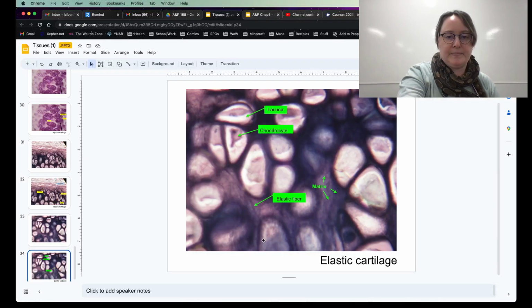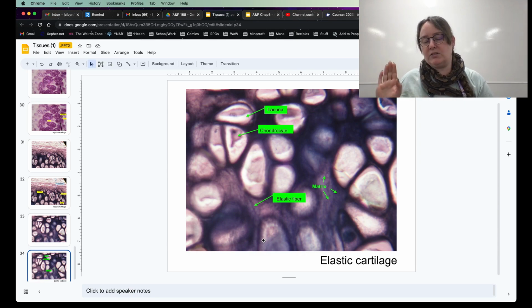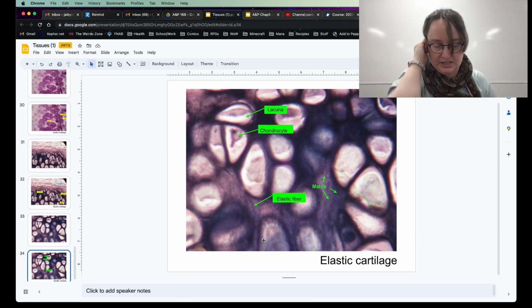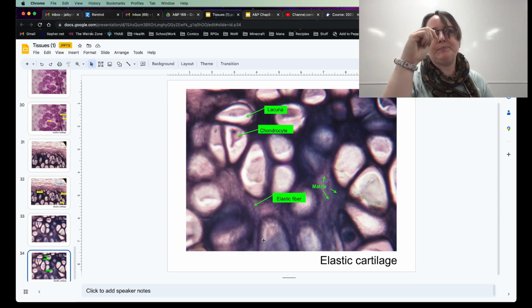All right. So I just wanted to get you basically, what does squamous look like? What does cuboidal look like? What does columnar look like? And I just wanted to give you that as a heads up. Because like I said, your book shows perfect slides. I wanted to show you some imperfect slides, because in a lab, that's what you'd be seeing. And I don't want to gyp you of your anatomy and physiology experience.